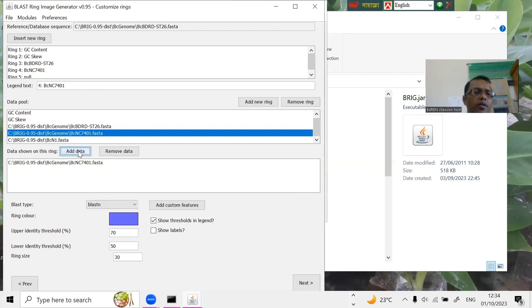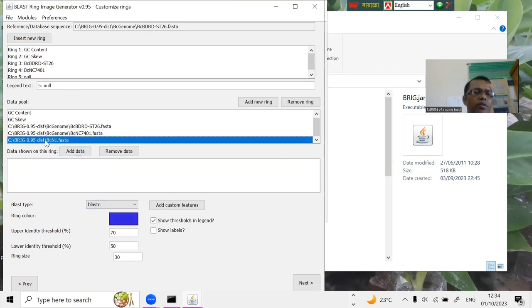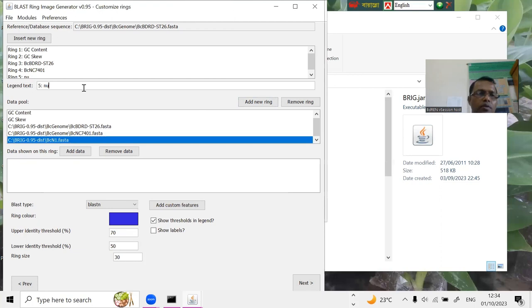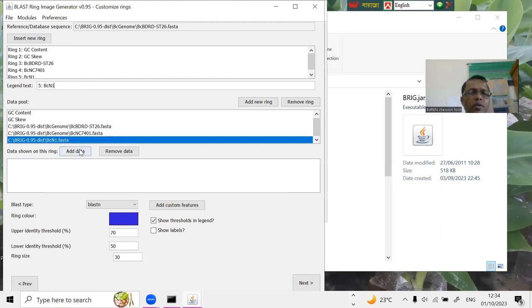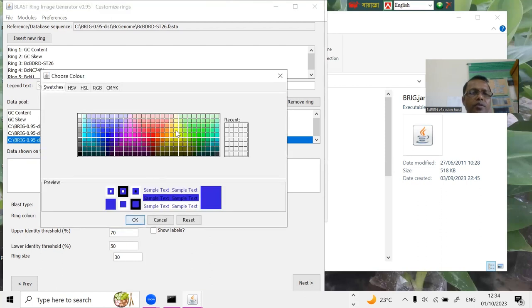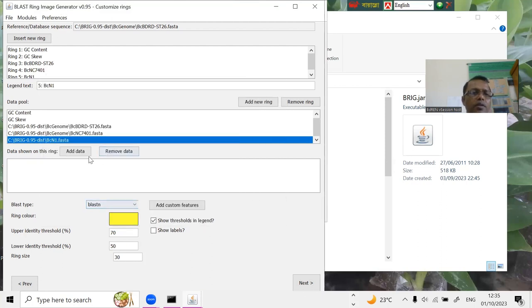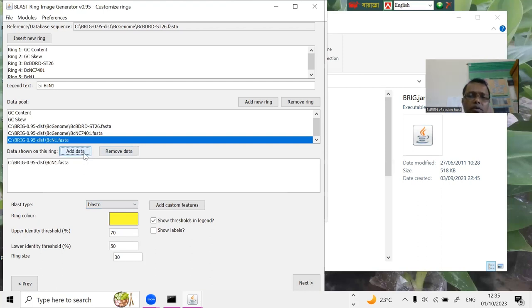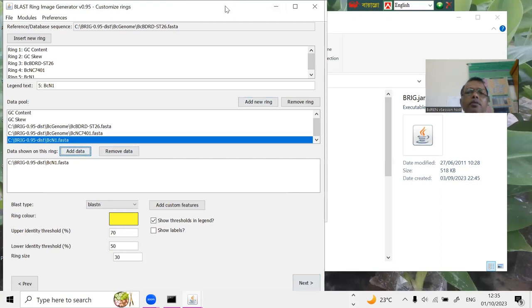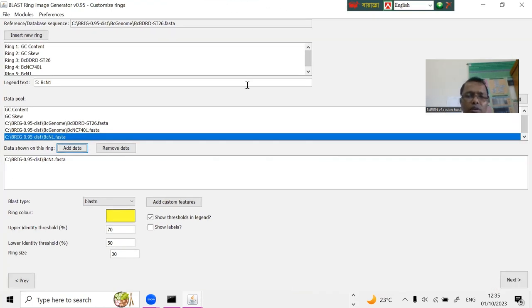That could be the different color, say, blue color, okay. Okay, add to the data, next, next, five, BC1, okay. BC, BC, BC, then, font. So, the color, change yellow color, okay. Then, add to the data. So, I have completed all the genome uploaded. So, now, click the next.